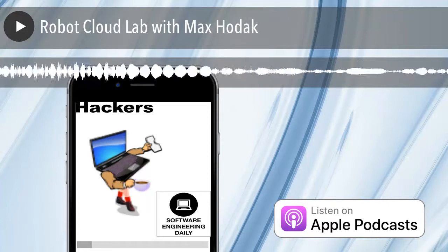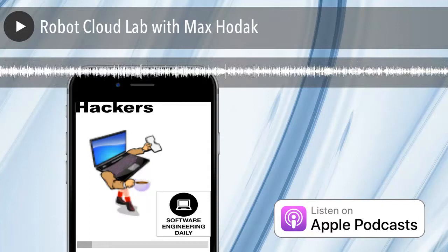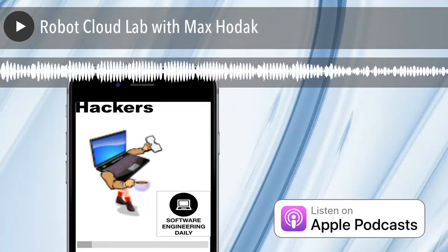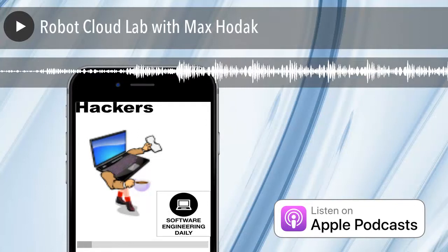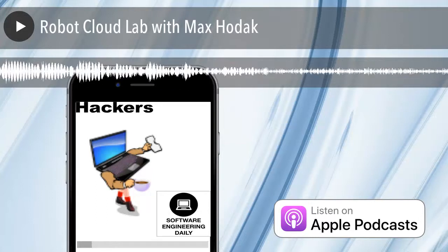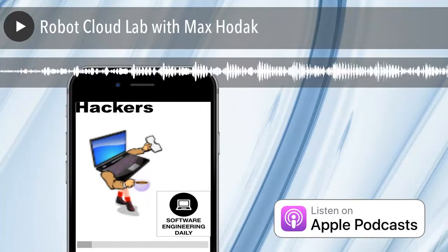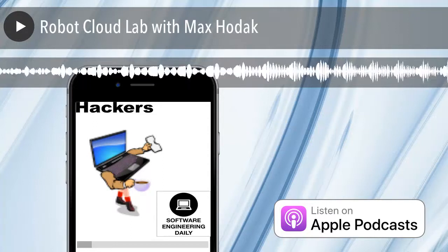So explain some of the other things that are in a work cell and what kinds of experiments those modules allow. It really depends. One of the key ideas behind Transcriptic early on was that even though there's a huge range of experiments, it's a relatively small set of devices. You can do a huge range of experimentation with just liquid handling, incubators, PCR, plate readers, sealing, desealing, flow cytometry. It's not all that many devices.